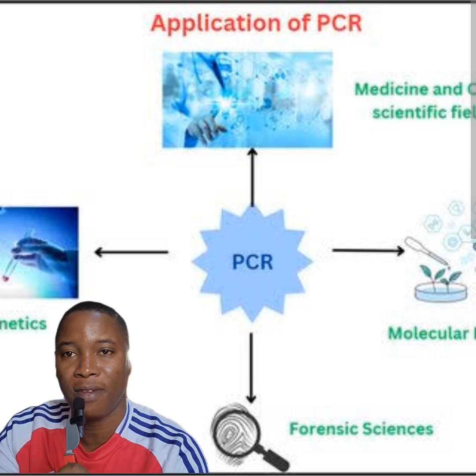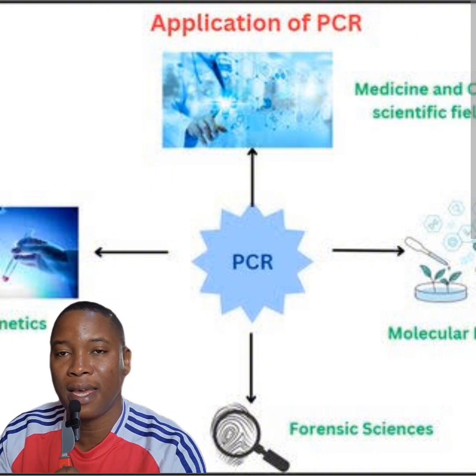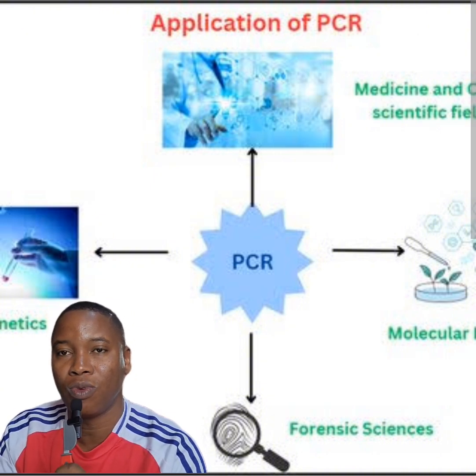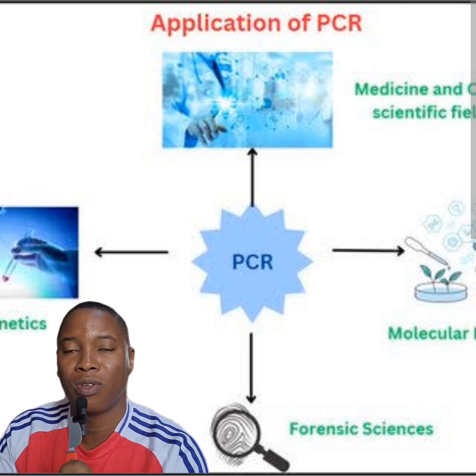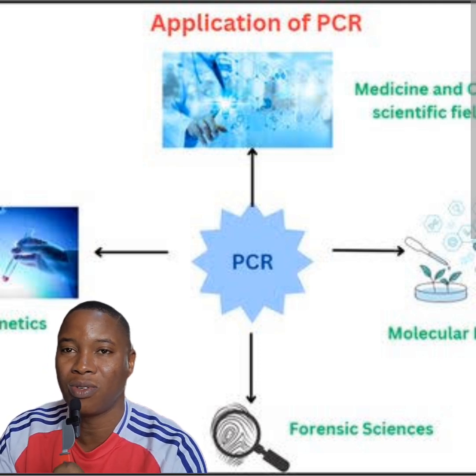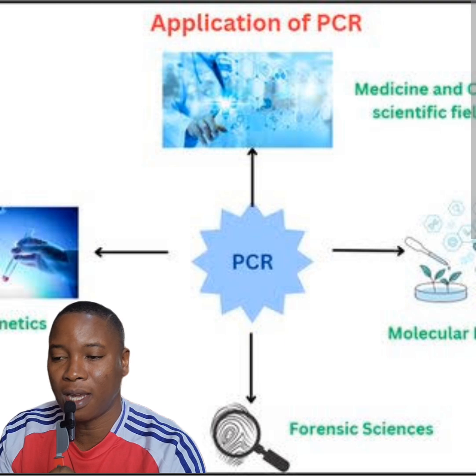You know what the individual nucleotides are, and then you take this information and run it against a database, the NCBI database, and that way you're able to identify that organism. So we use PCR to do a lot of identification in the field of medicine for medical diagnosis. So COVID, different types of illnesses, we're able to identify them using the PCR method.